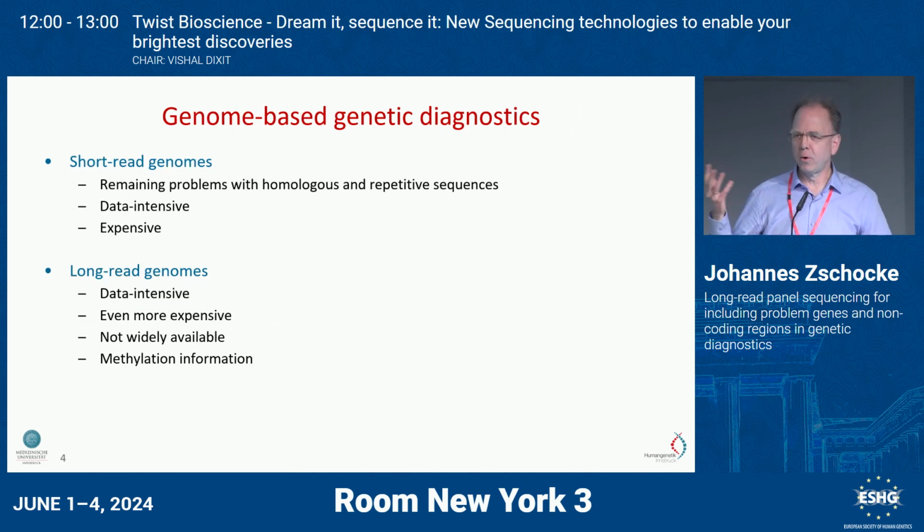So what are we all talking about? We're all talking about genome-based diagnostics, which retains some of the problems. And to resolve even further problems, we had several meetings here about long-read genomes, which are lovely. They're great, you get methylation data, but they are very data intensive.